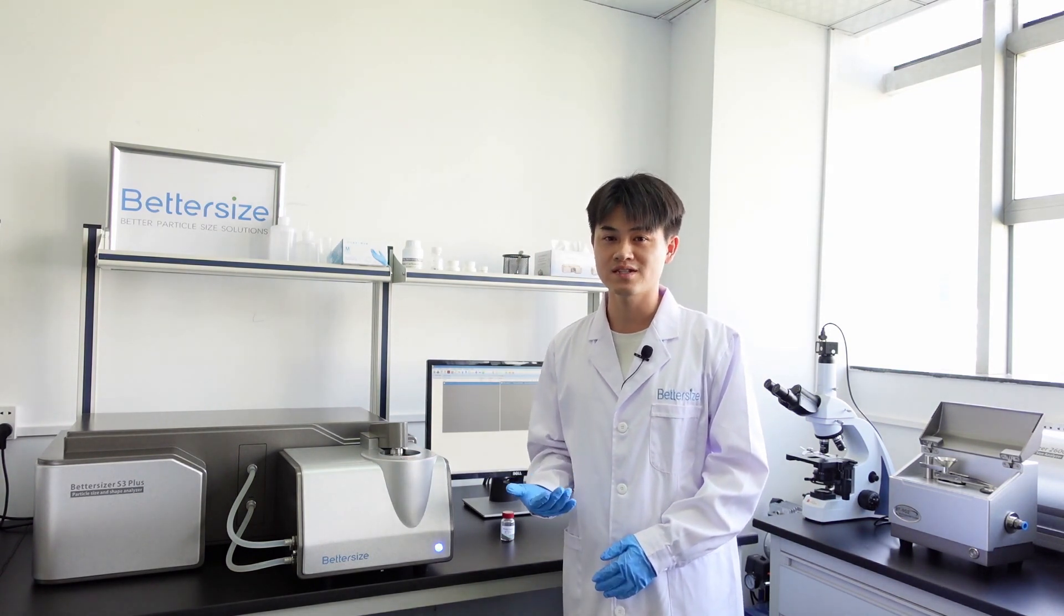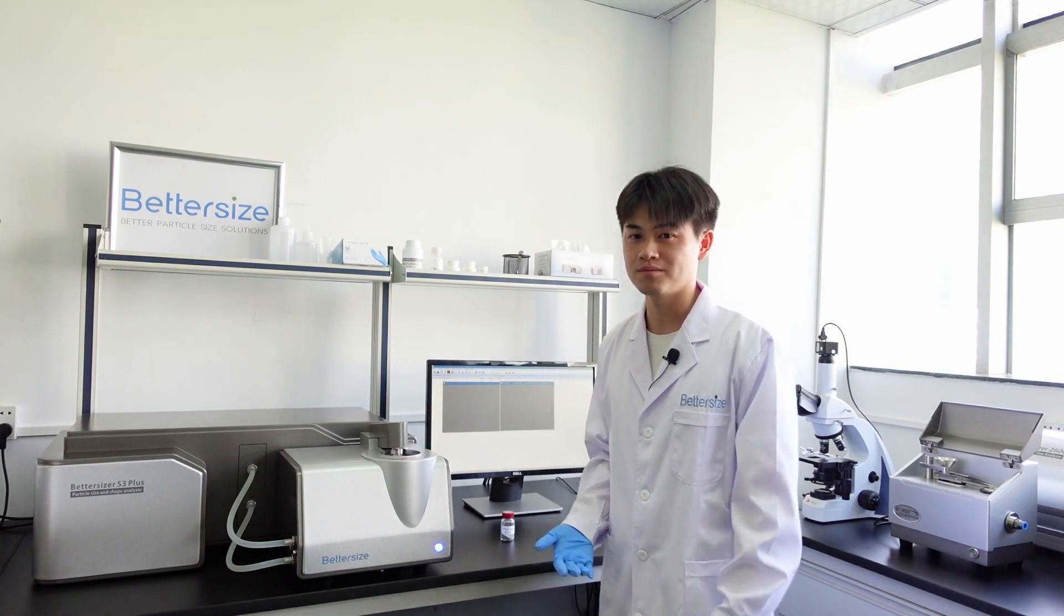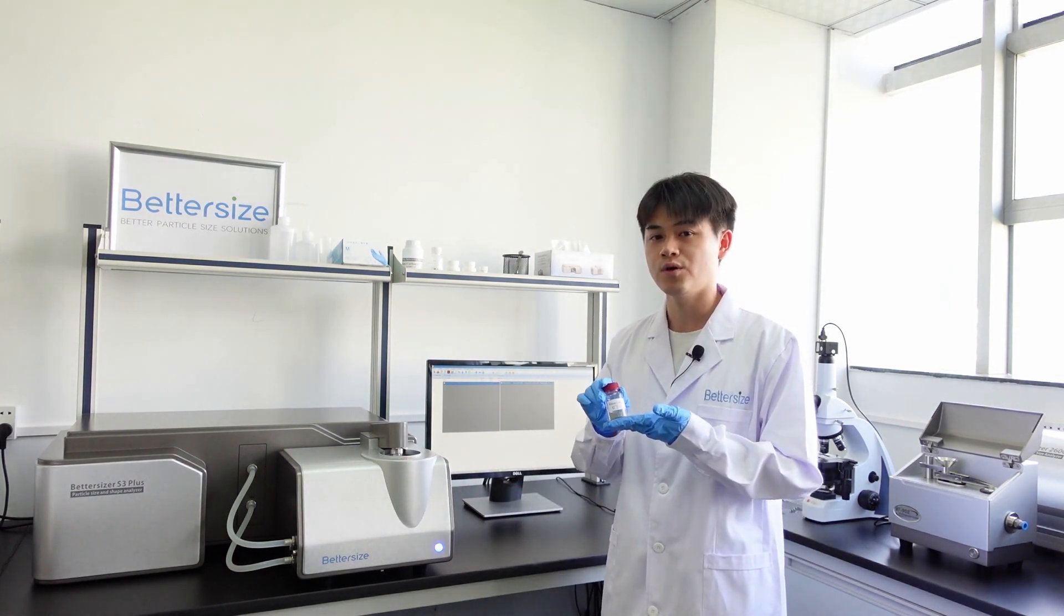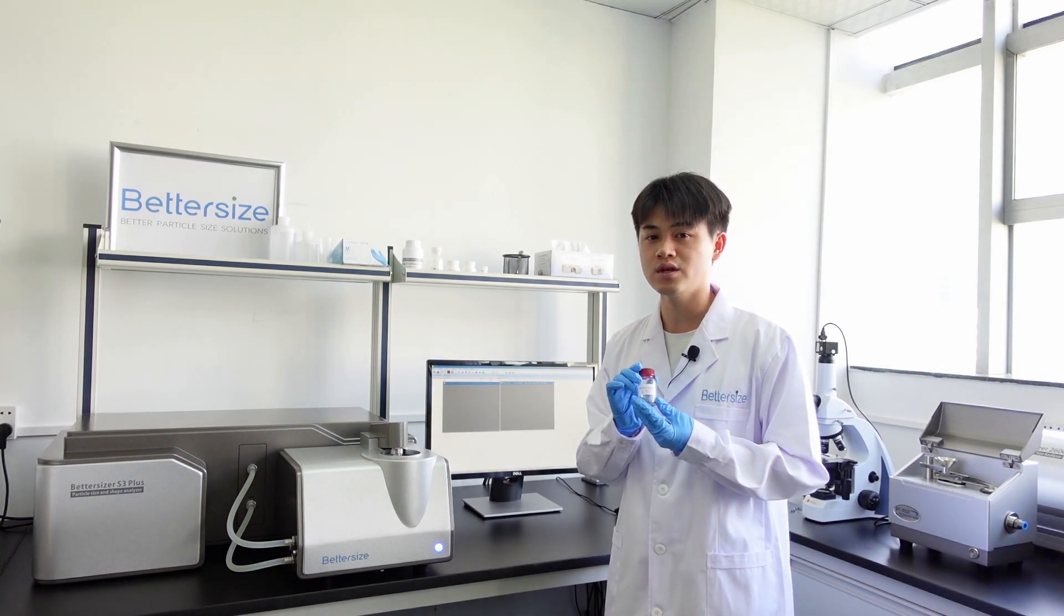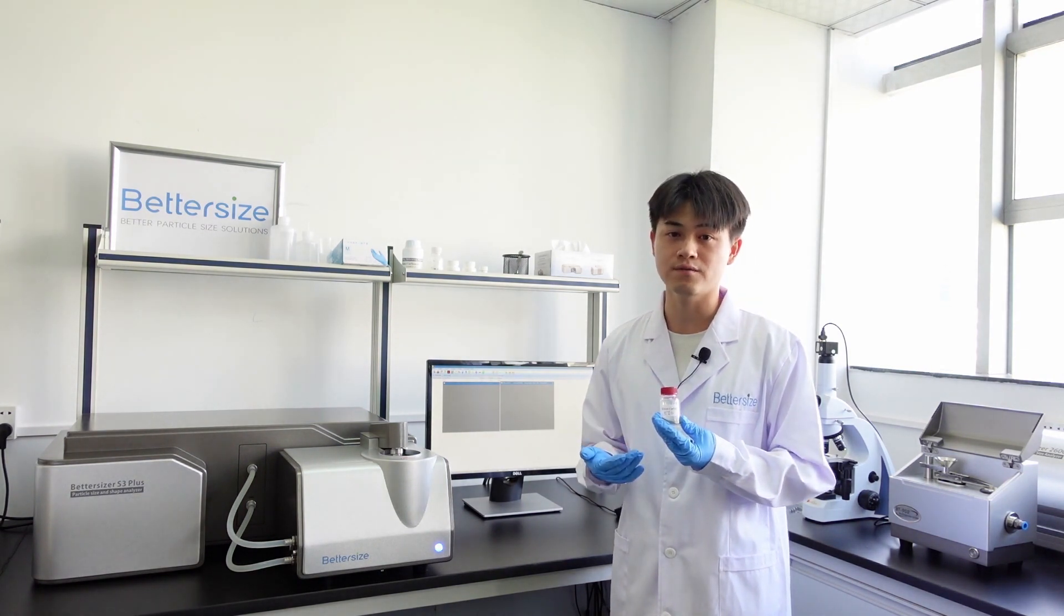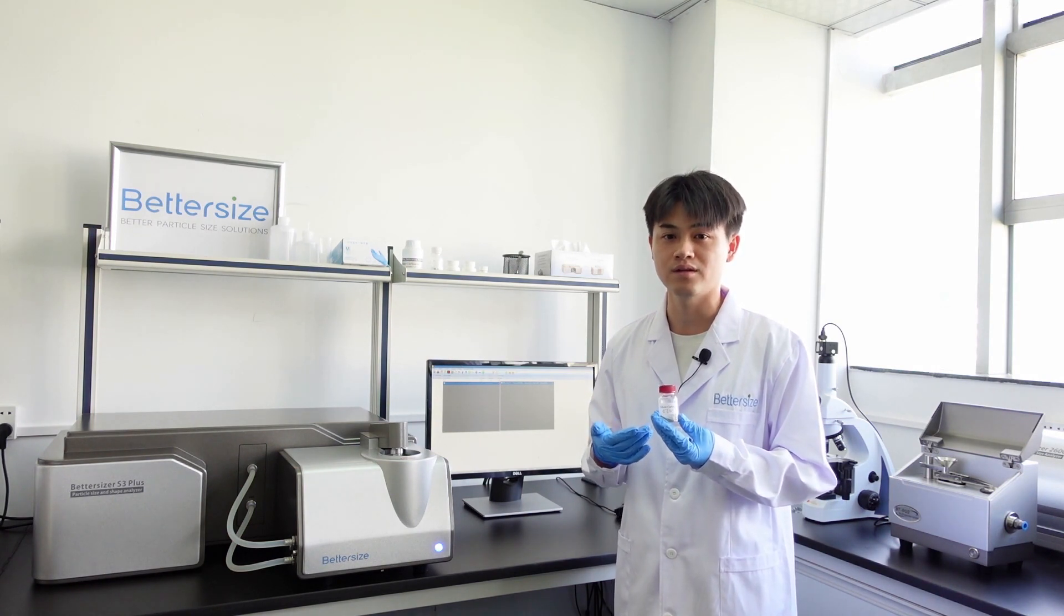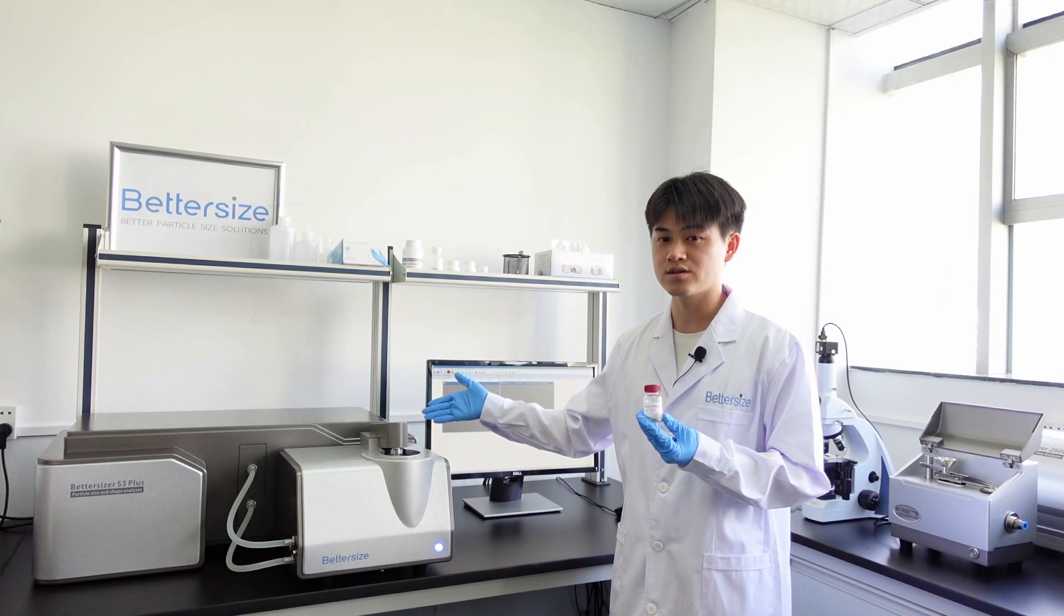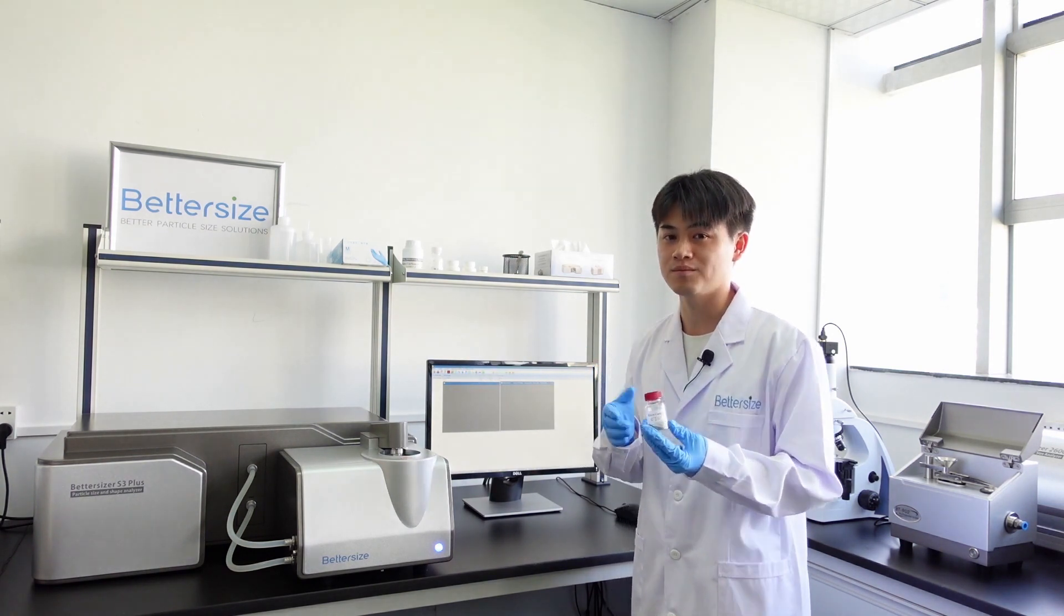Let me show you what the Bettersizer S3 Plus can offer you by measuring a sample. This is one of the samples sent back to our lab. The composition is silicon carbide, which is a commonly used abrasive as well as a typical semiconductor material. Today, I'm going to use the Bettersizer S3 Plus to measure its particle size and shape as a demo.